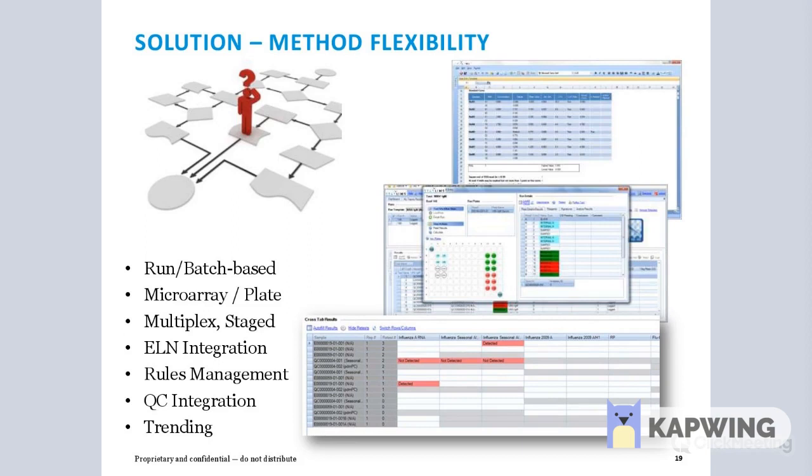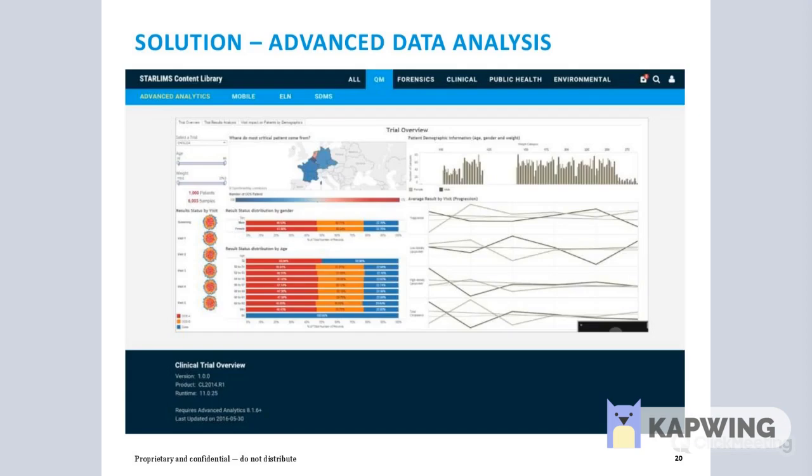In summary, a LIMS that can accommodate a wide variety of testing protocols provides flexibility needed when dealing with multiple client and project needs.